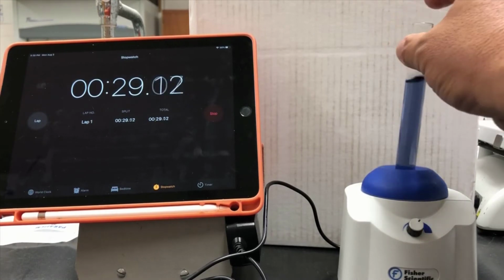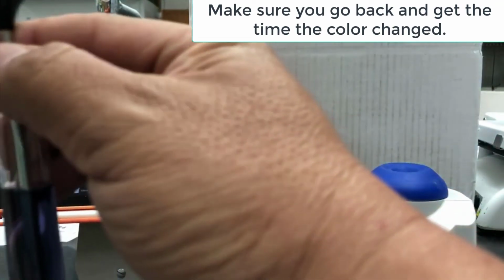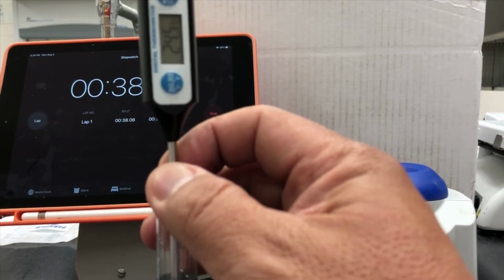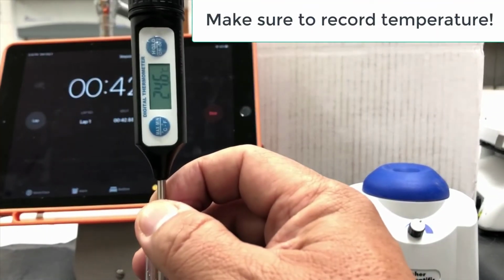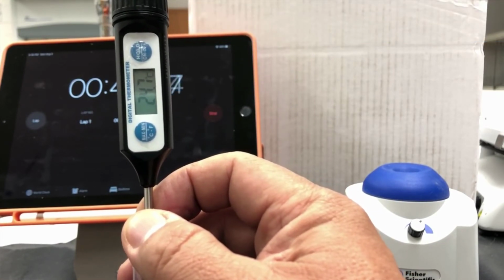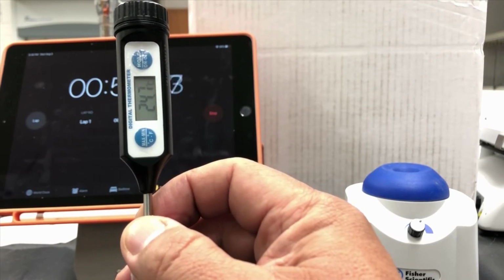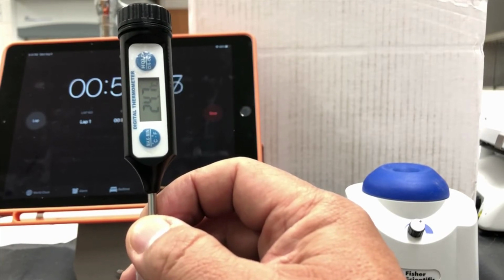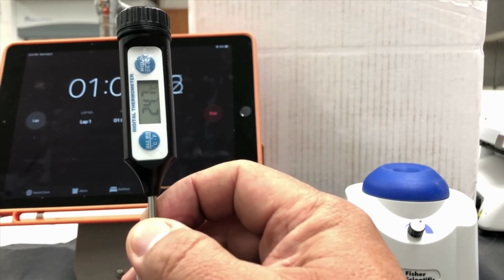There we go. Now you'll have to go back and pause and record what that time was. But what we'll do now is we'll focus on where the temperature comes to. And it looks like it's, like I said, around 24.7 degrees, okay? So take that as your temperature for room temperature. The other temperatures we're going to do will predominantly be cooler, and we're only going to do 3 or 4 for our Arrhenius plot, okay?